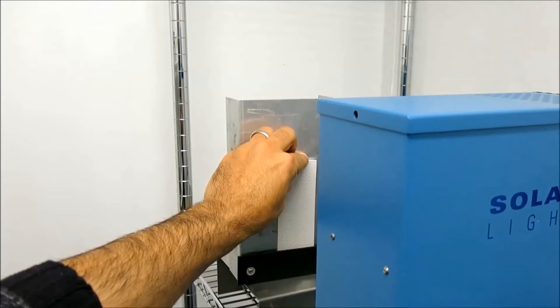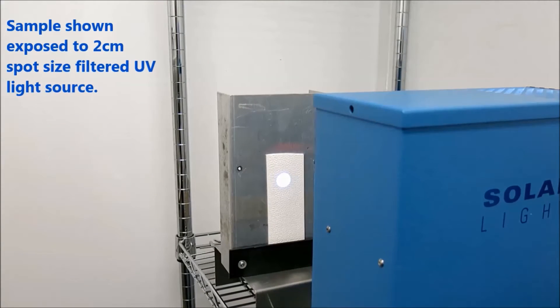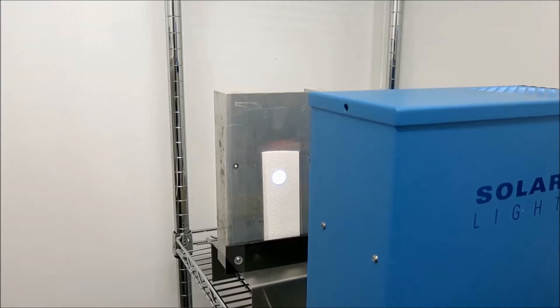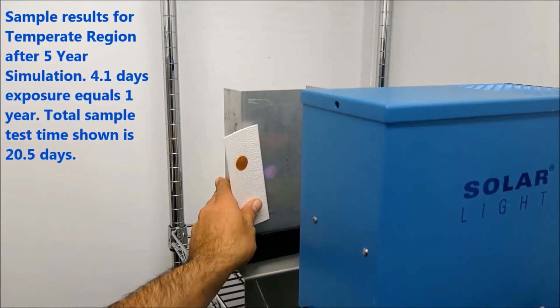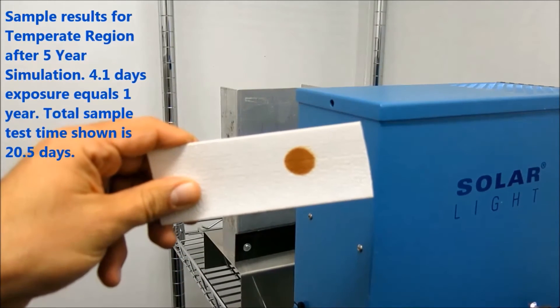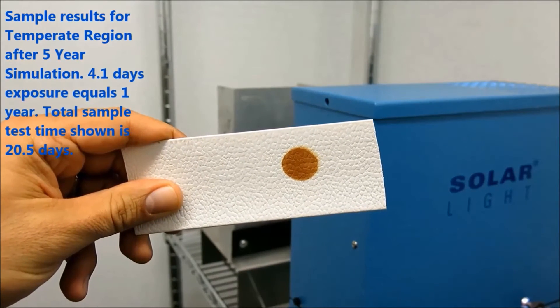Typical applications include testing plastics, paints, coatings, inks, dyes, vinyls, and fabrics. By eliminating the visible and infrared light from its output, UV levels 10 to 12 times stronger than tropical sun can be produced without the thermal component associated with these high levels of light. We use these same simulators to provide contract testing services to test fabrics and materials here at Solar Light, so you can be sure that our equipment will meet your professional needs as well.